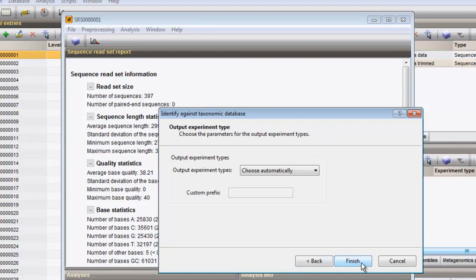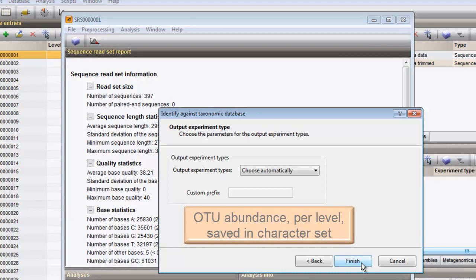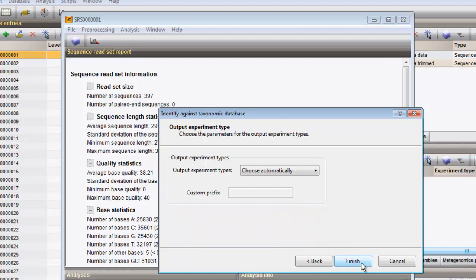The results of the identification are OTU abundances for each of the phylogenetic levels. These data will be saved to the bio-numerics database as character sets. One character experiment will be created for each phylogenetic level included in the analysis, and within one experiment, each character will represent one OTU at that phylogenetic level. With the default option, we let the software automatically decide to which character experiment the data should be saved to. I can press Finish now to start the analysis.